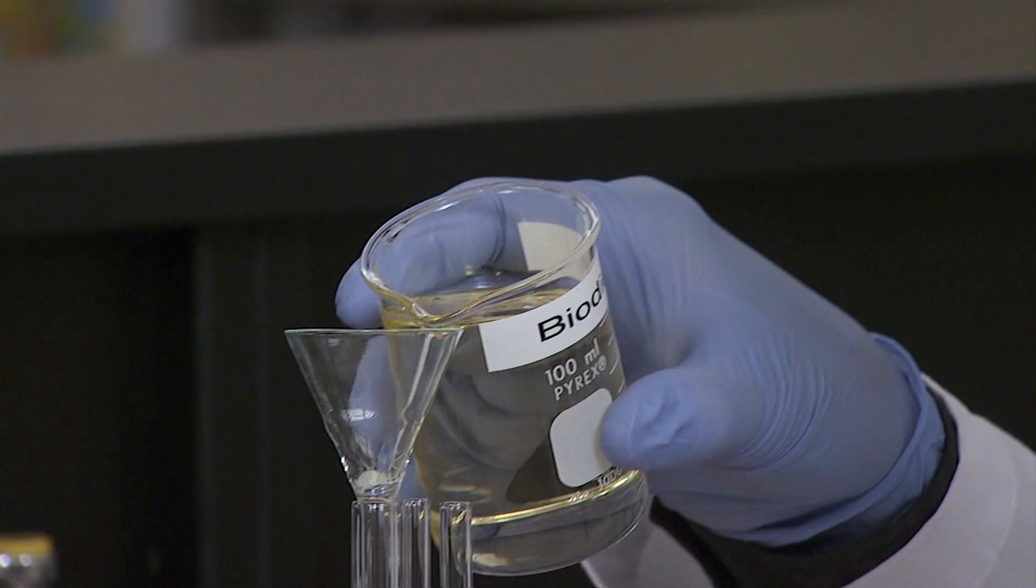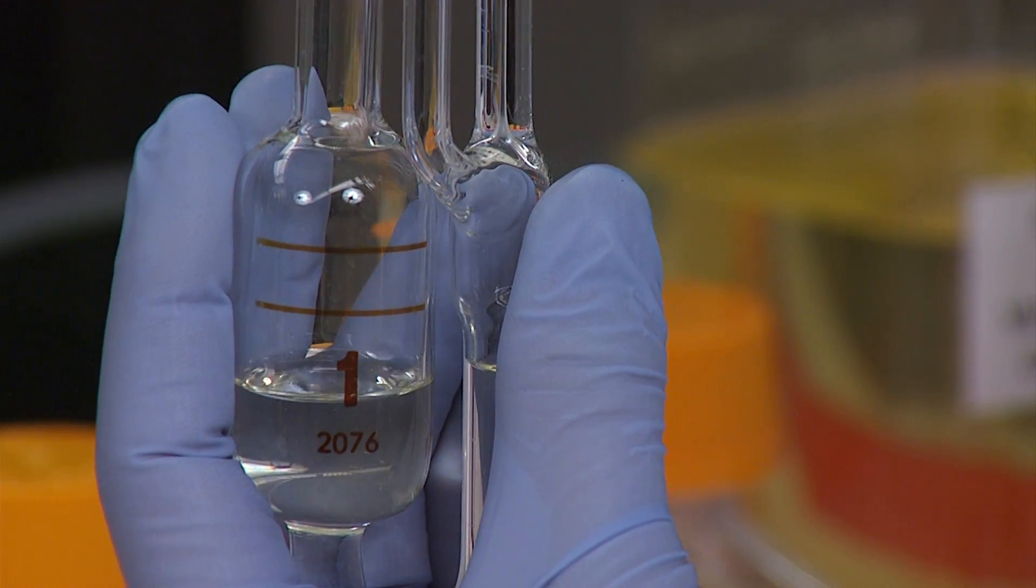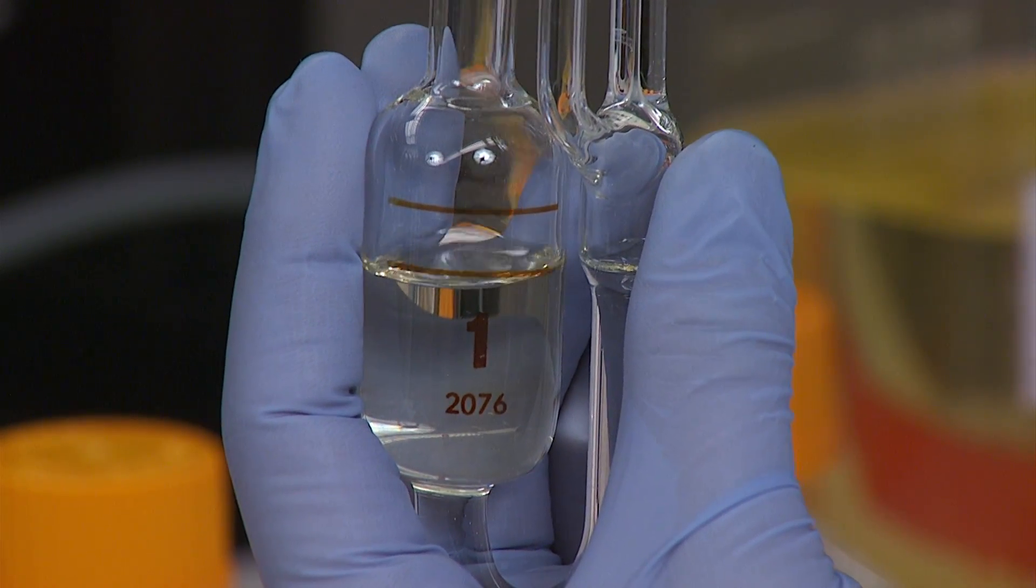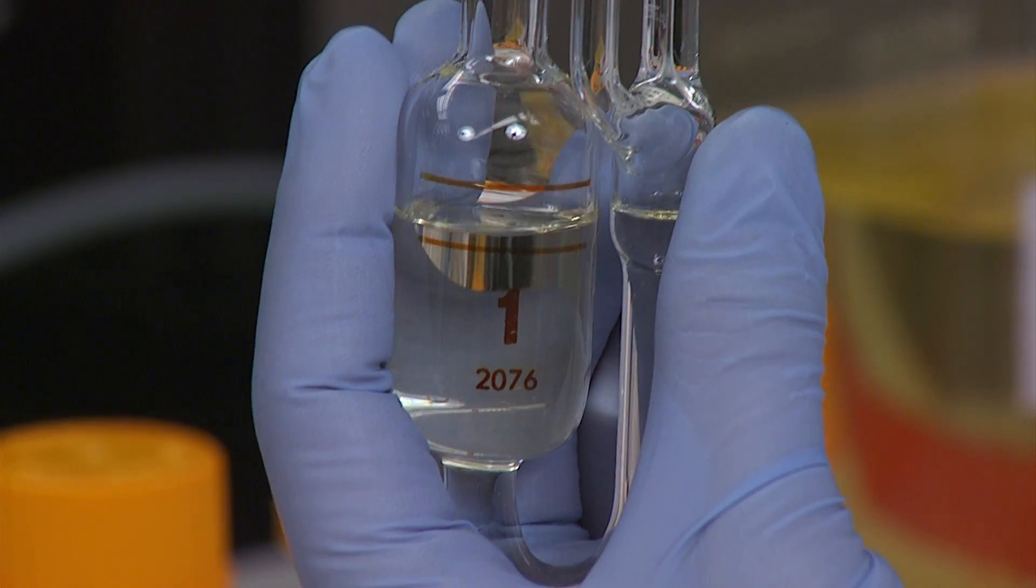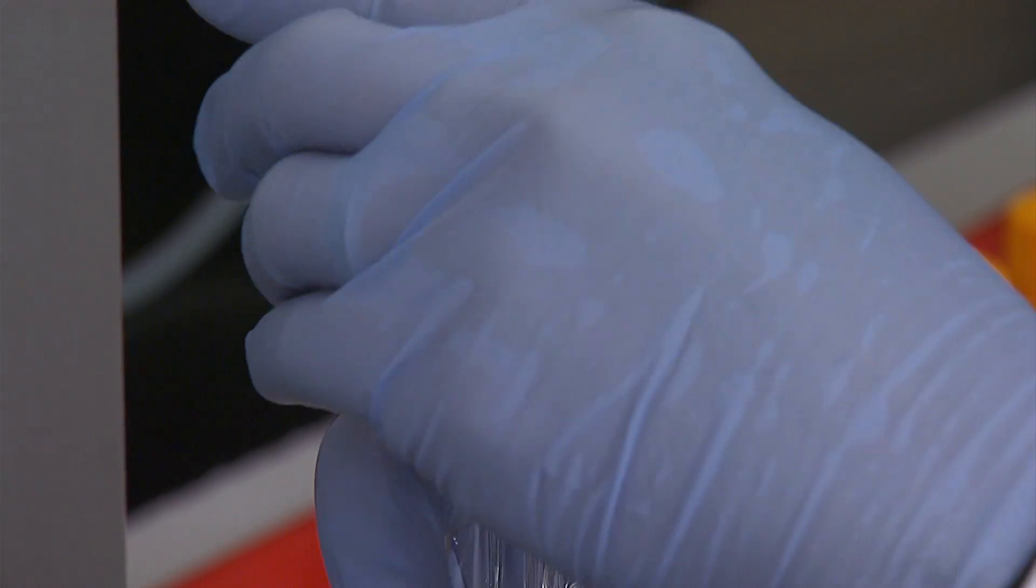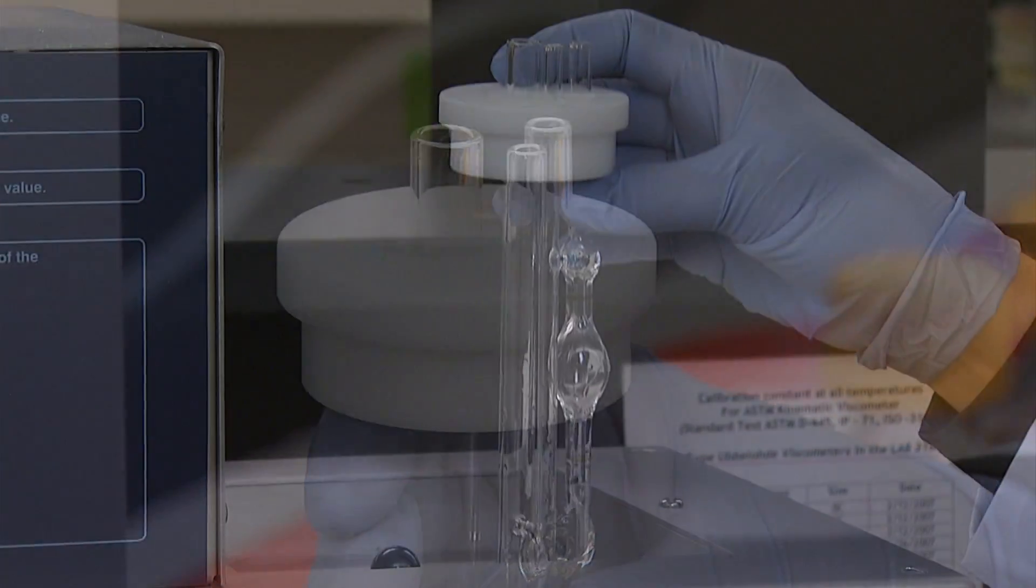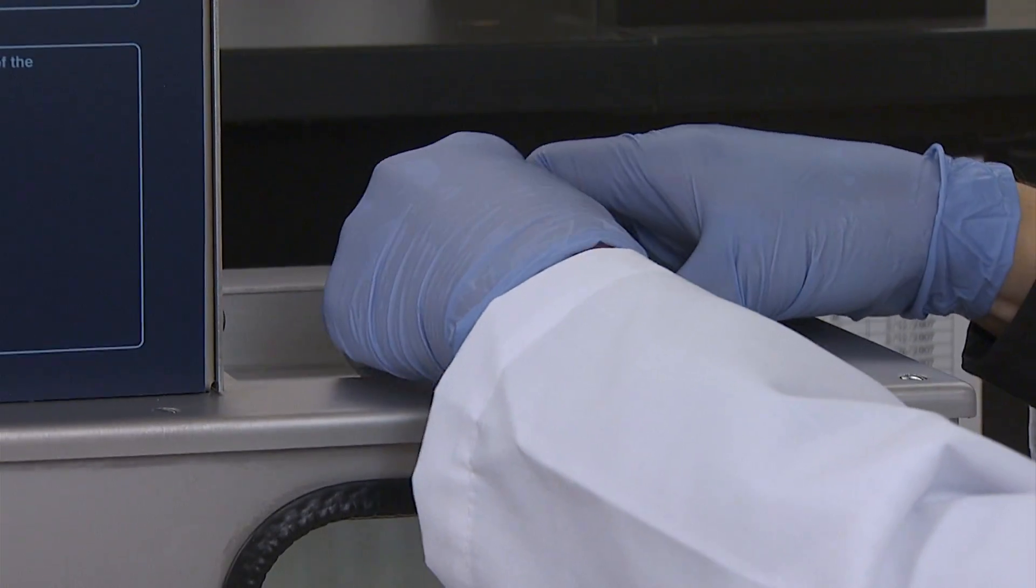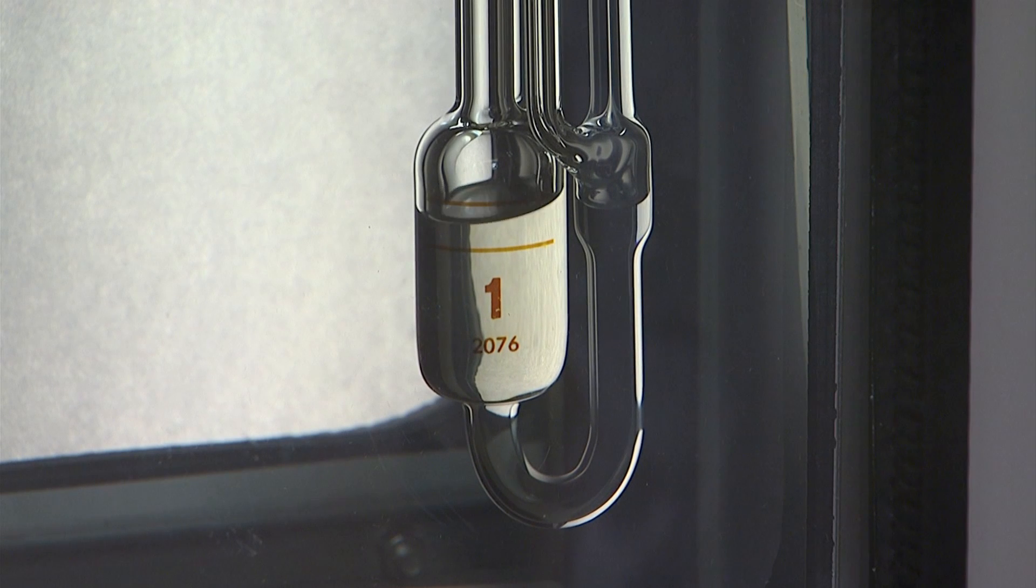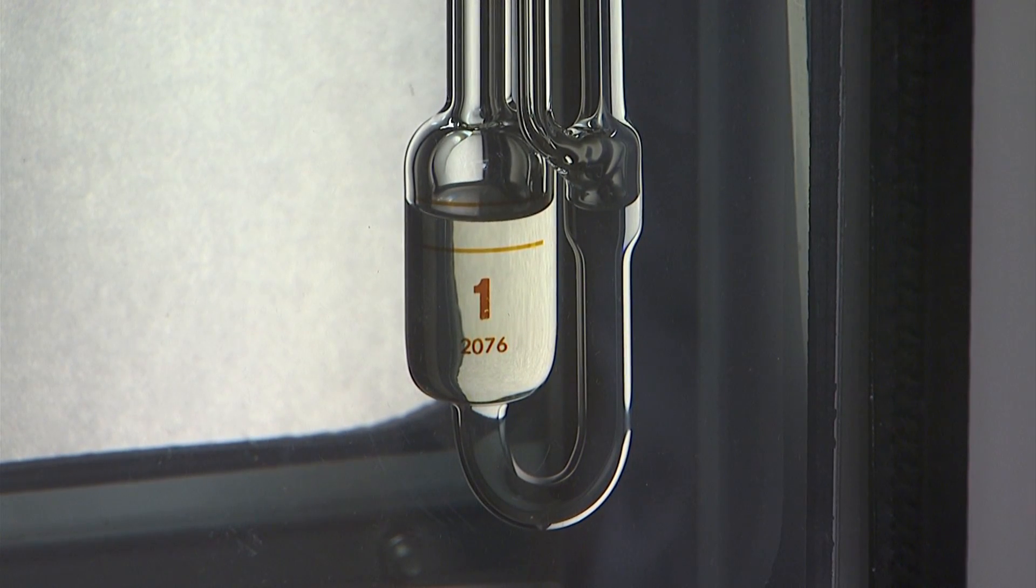Carefully transfer the sample to the viscometer with the final fluid level between the two lines on the reservoir bulb. The reservoir bulb is the largest section of the viscometer and will have the size and serial number printed on the outside. Equip the viscometer with a holder and place it in the bath. The holder should sit firmly in one of the top openings of the bath and the viscometer should be held securely. Allow the sample temperature to equilibrate by leaving the viscometer in the bath for at least 30 minutes.